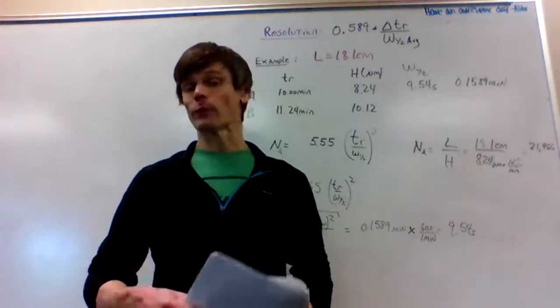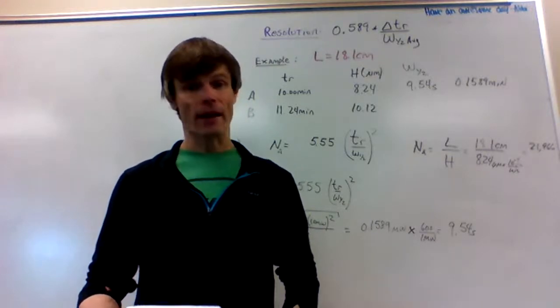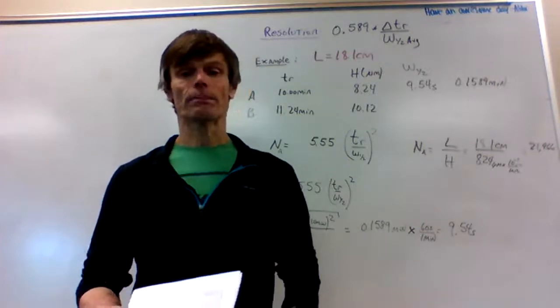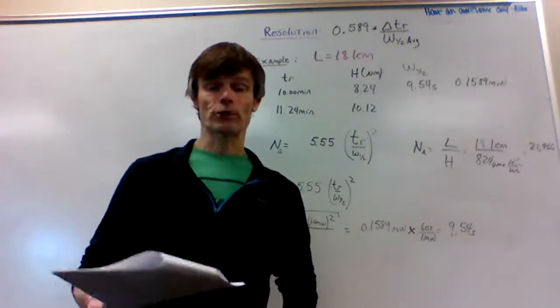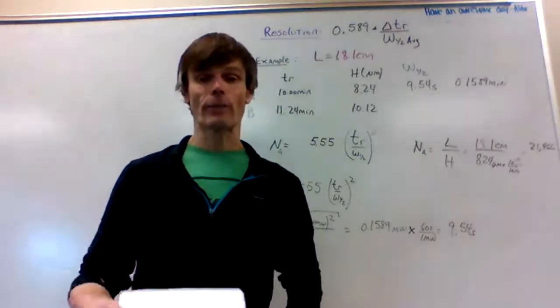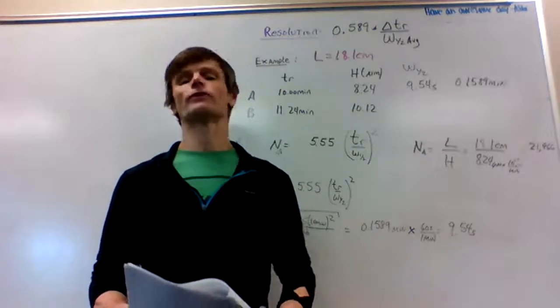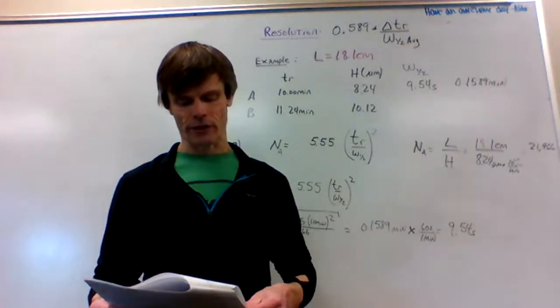And our final topic that we'll finish up with at the very end of the lectures on Friday is quantitative applications, how we make up a calibration plot, how we use peak area to help us understand a little bit about the relationship between how much of a substance is in a sample and the chromatograms that we're working with. So in our lab section, my lab section, you've had some experience with those, and I will go over it in more detail for everybody in the lecture course.